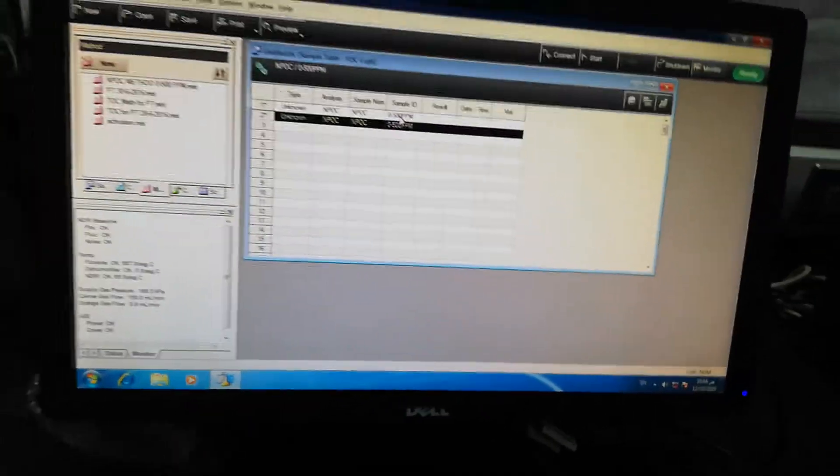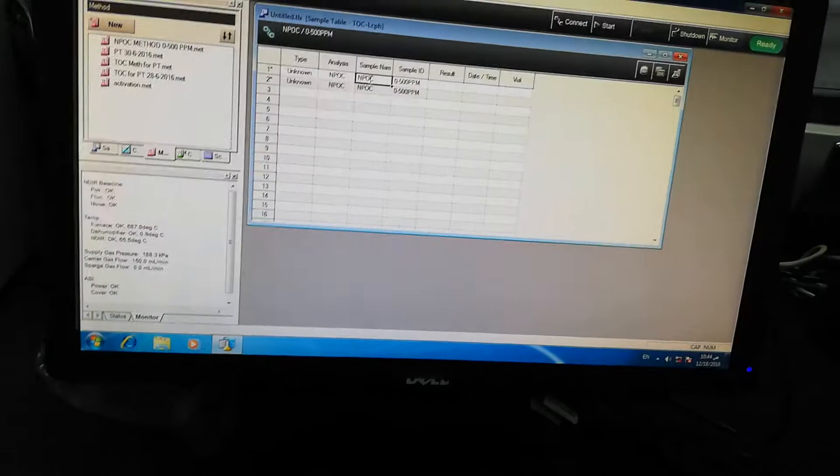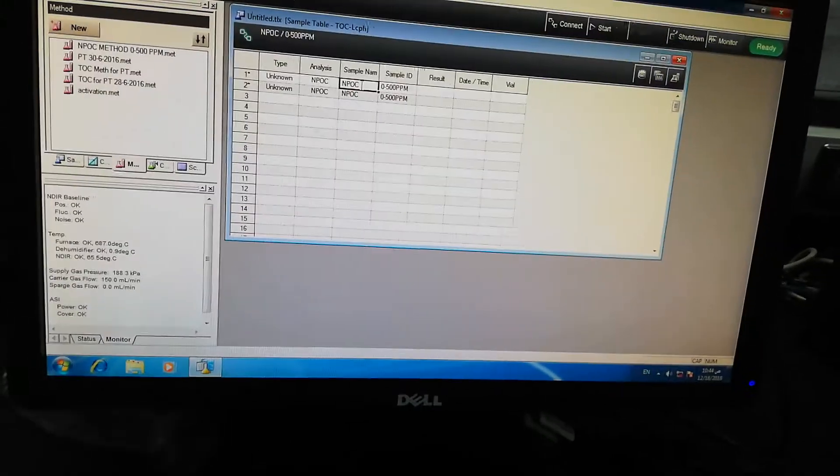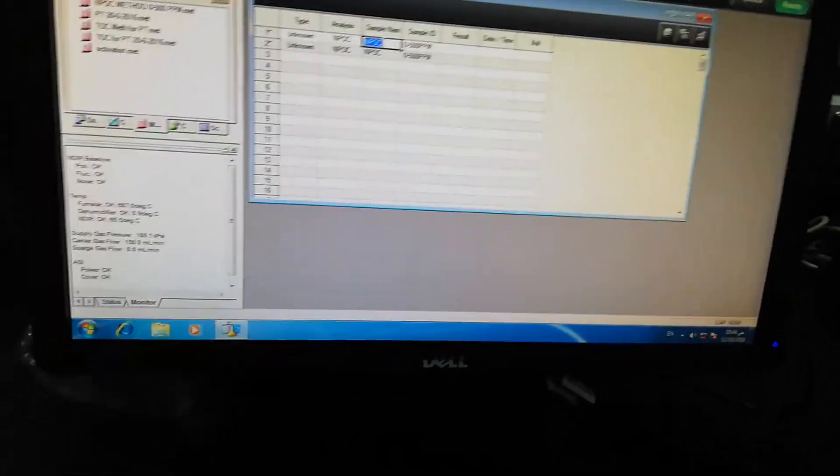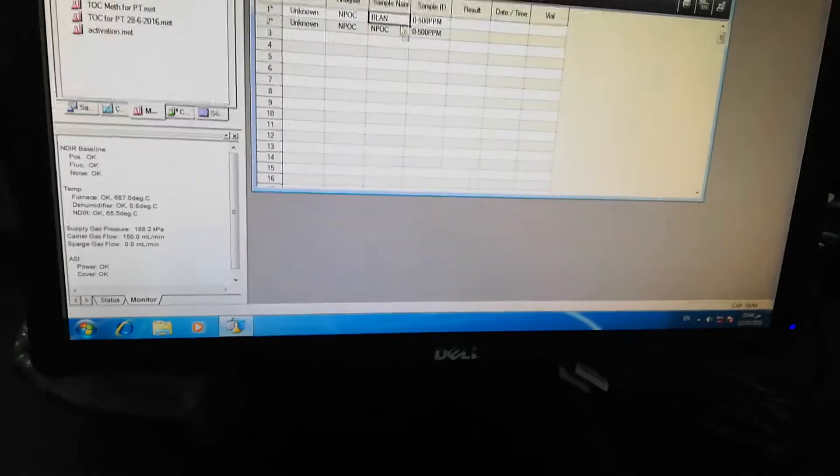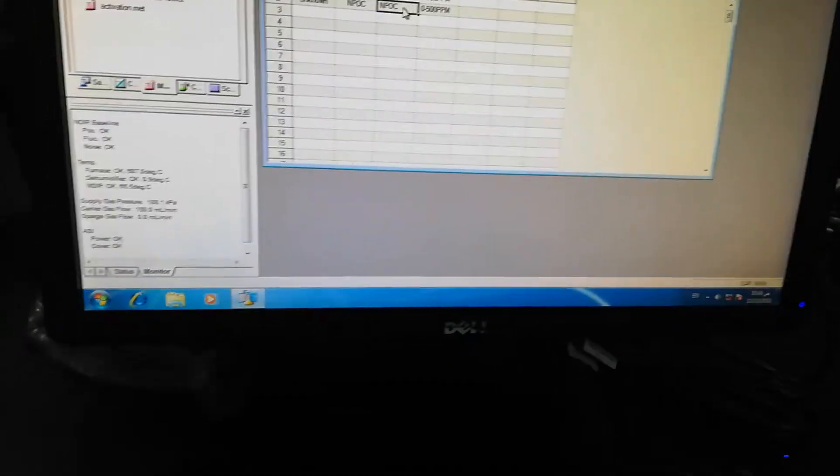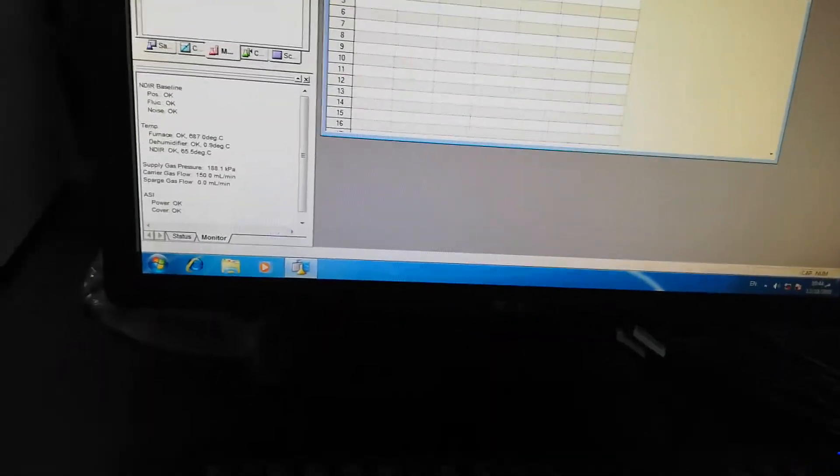So what I will do, I will just... here you can position the sample name - any blank or QC.